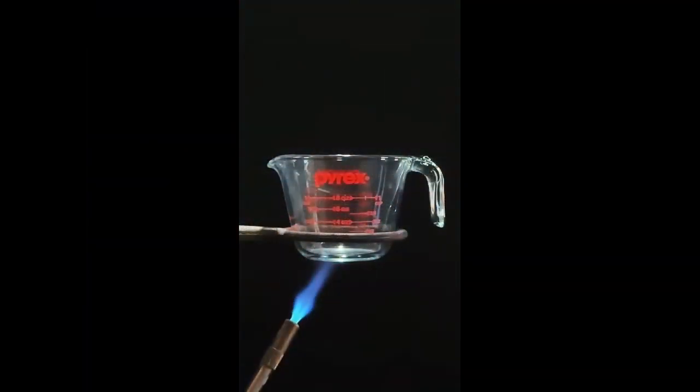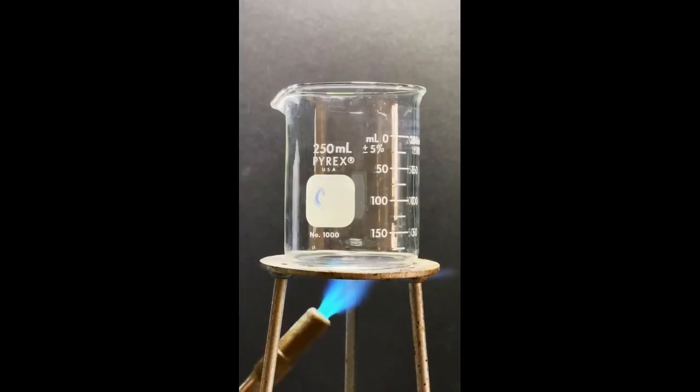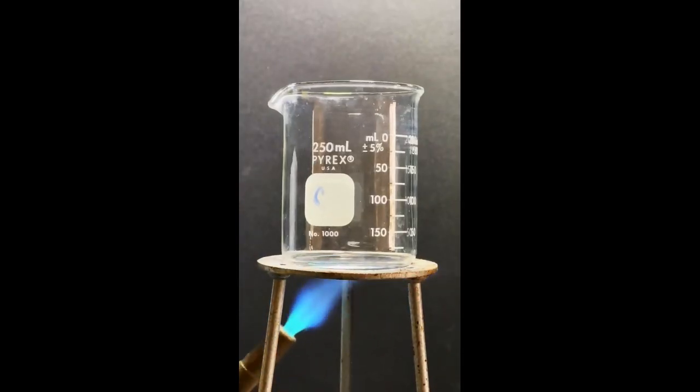In certain cases, when Pyrex glassware has been heated to high temperatures and then allowed to cool, it spontaneously explodes. This is especially true if the hot glass comes into contact with water. On the other hand, Pyrex glassware made for the laboratory resists shattering when it's heated and then allowed to cool.